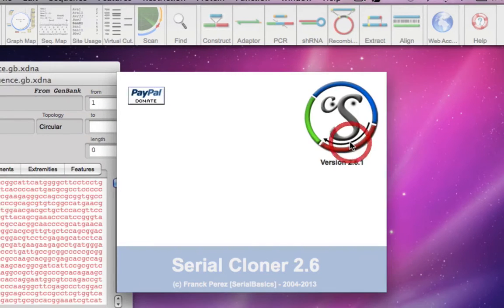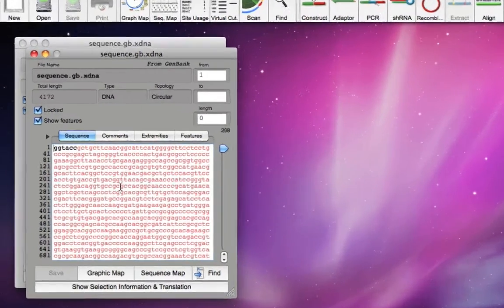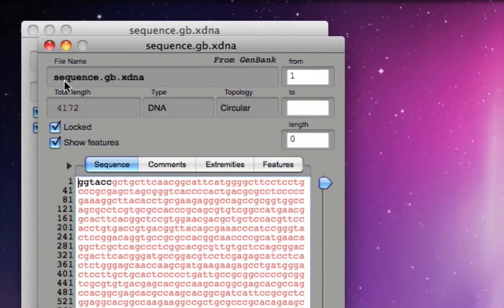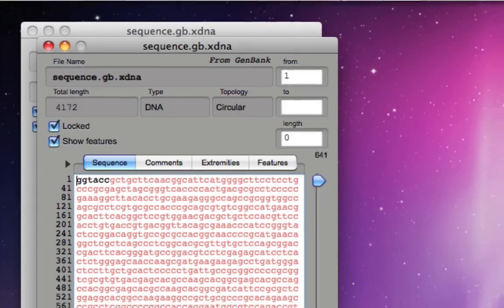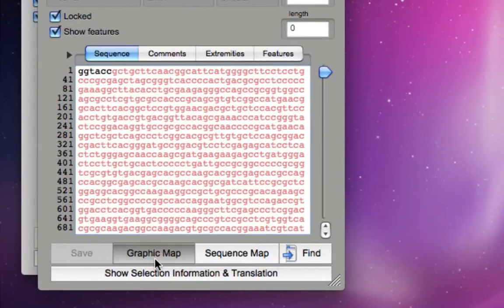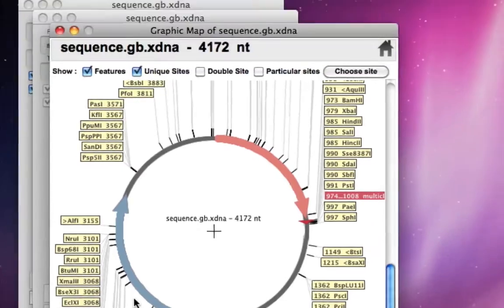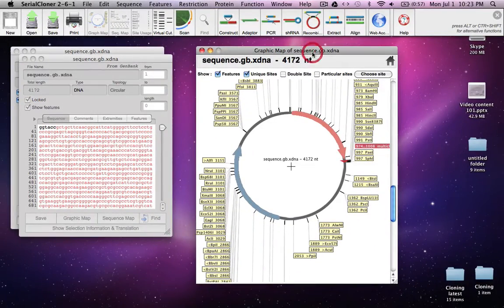Just hit OK and there you go. The small box says this is the sequence name, size, DNA, circular, etc. You can hit the graphic map and there you go, you have the entire plasmid.